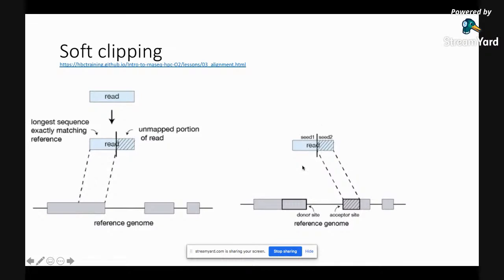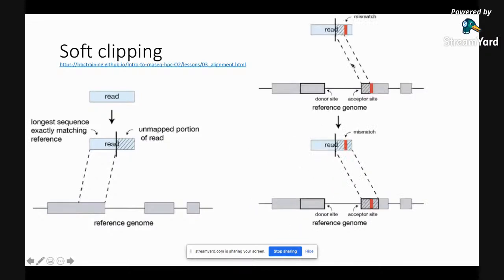Yeah. Next thing is you might have a mismatch. So maybe there was a mutation during sequencing, or there is a SNP, right? So the animals or the samples that you used had a SNP. They had a variation which was not in the reference genome, right? Because the reference genome comes from a different animal or sample.